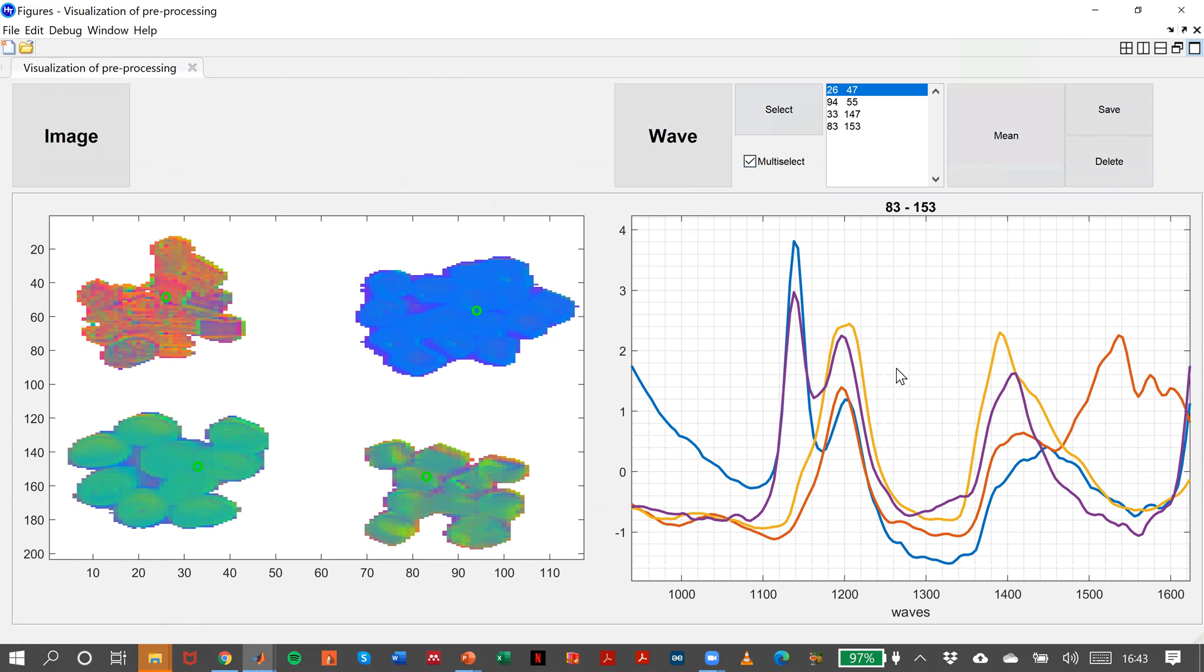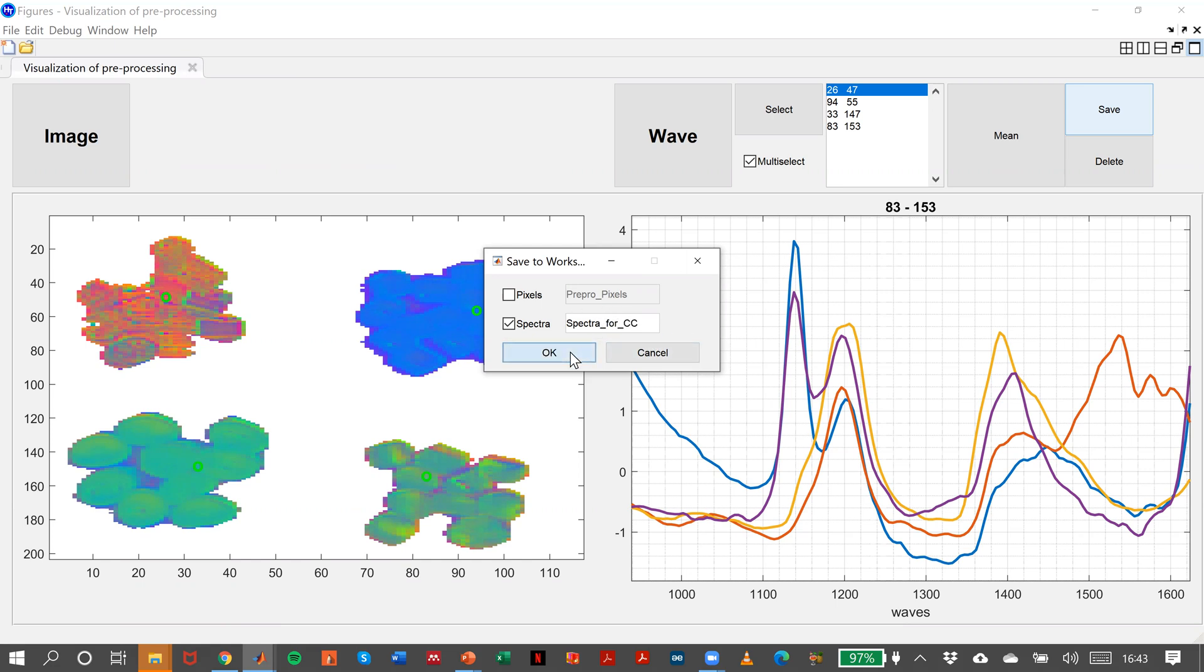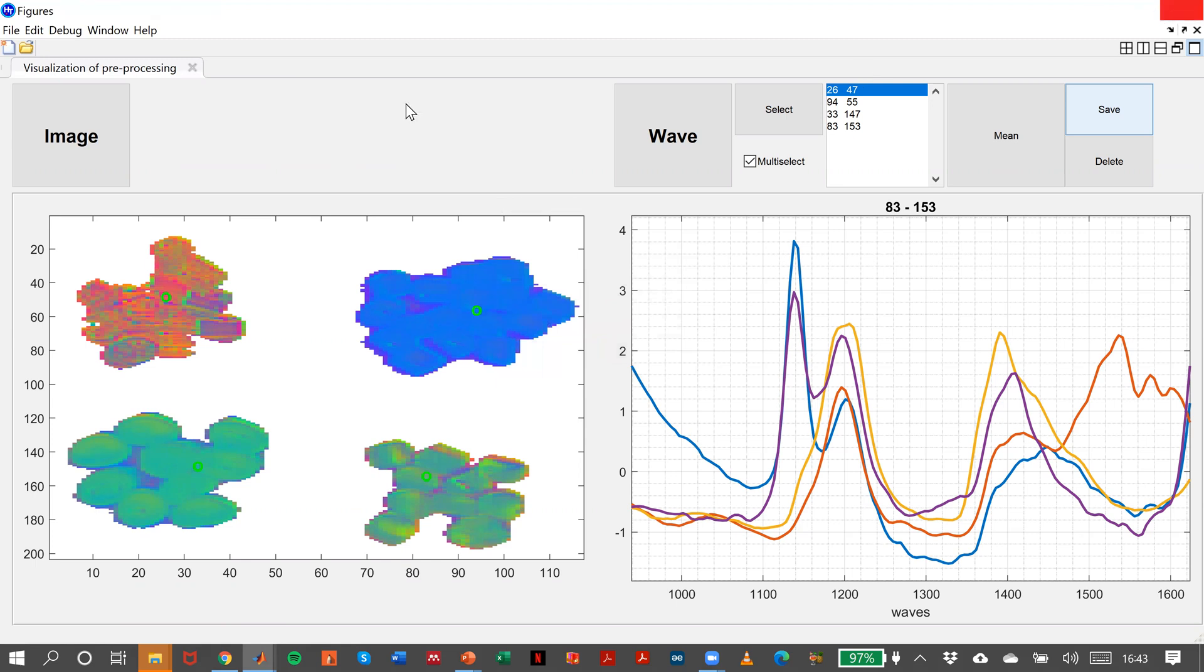So once I have these four, I will save it in my workspace. I would say pre-prospectrum instead of spectrum, four correlations. And I close this window, and I come back to my analysis tab.